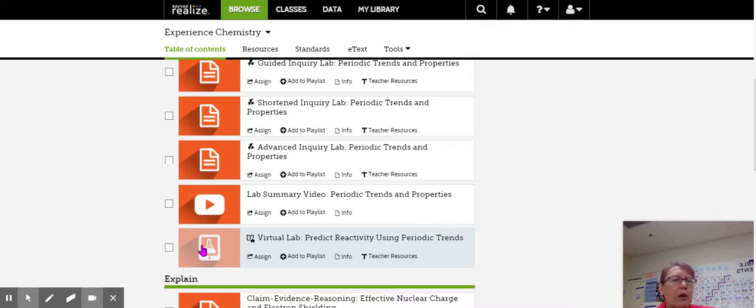So the first thing you're going to want to do is go to the online textbook. And there, if you go to your class period assignments, you will find this virtual lab. Make sure you find it in assignments so that it records that you have completed the lab.